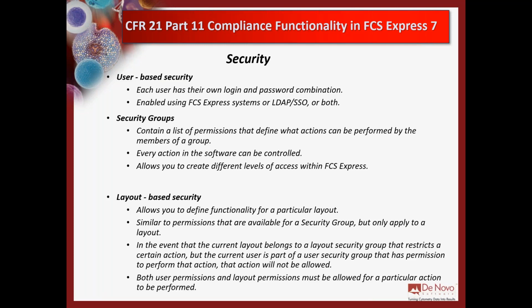Now, when we add security users, we have to have the ability to allow certain users to do certain things and other users to not do certain things. So somebody who's an administrator of the system, we want them to have permission to do everything in FCS Express. However, somebody who's a technician who's performing an analysis that day, you might want to limit, right? Maybe they can't move plots, maybe they can move gates, but they can't delete things, right? So what we do in FCS Express is we have a list of permissions that defines what action can be performed by the members of a group.